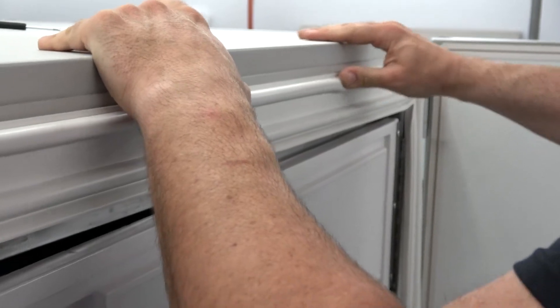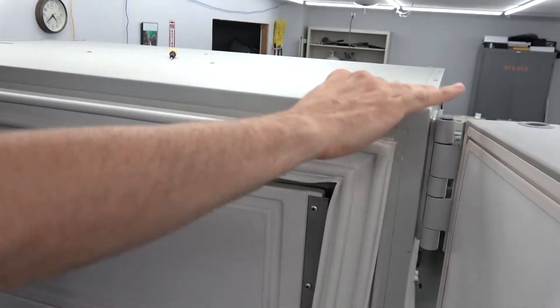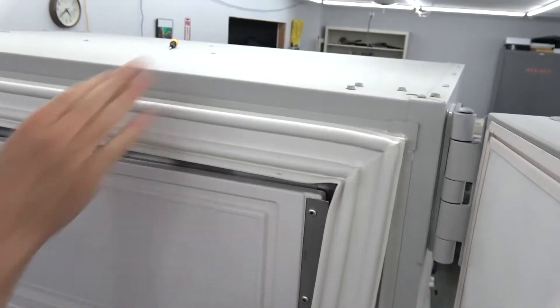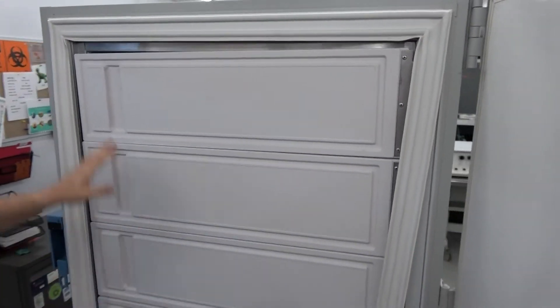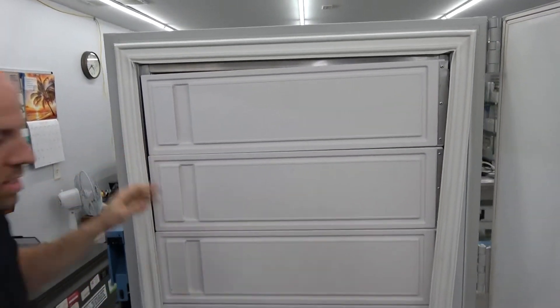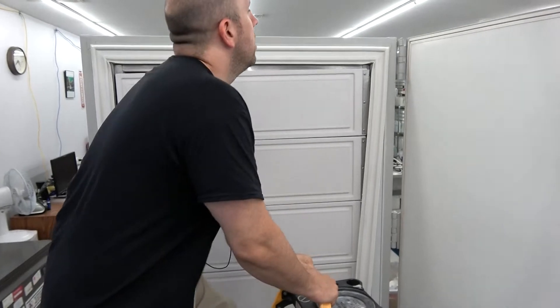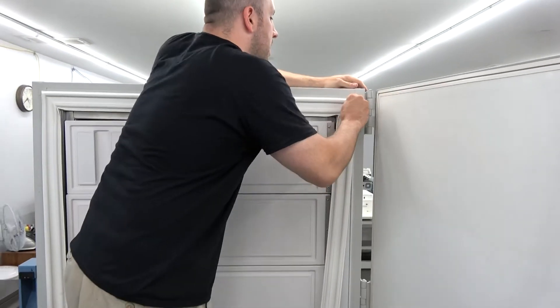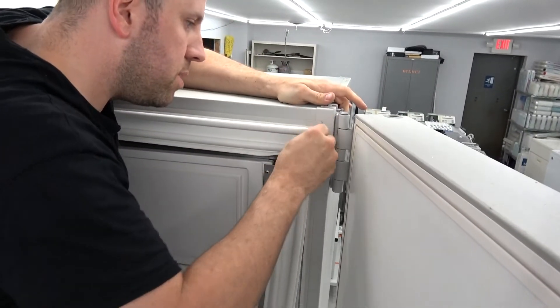Instead of having a tech come out and charge you $300, $400, $500 to just do this, you can do it yourself. And considering this large seal costs around $300 from Thermo — that's already pricey — if you can also avoid paying a technician to come install it, that saves you some money.